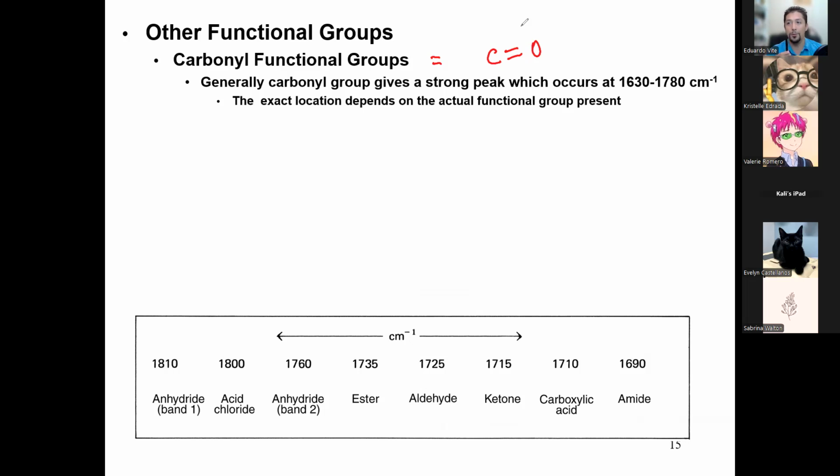So you have to use that word. You have to say the word carbonyl when you are referring to the carbonyl stretch. You can't say this is a ketone stretch because you don't know if that's a ketone. A ketone contains a carbonyl, right? Functional groups contain carbonyls, but they each have their own name. So it's like the first name and the last name, right? Like who are you? Like the ancient Spanish conquistadores, right? Like what is your name? I am Juan Ponce de Leon, right? They have like their long last name.